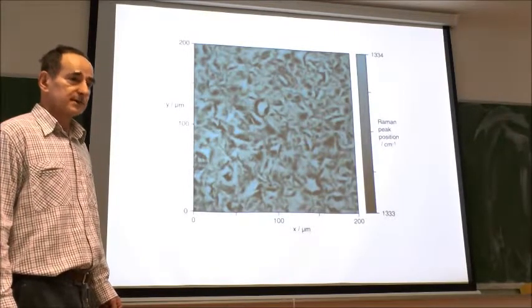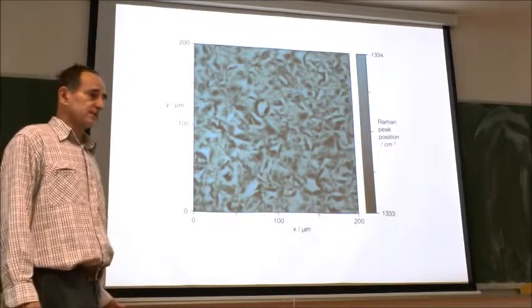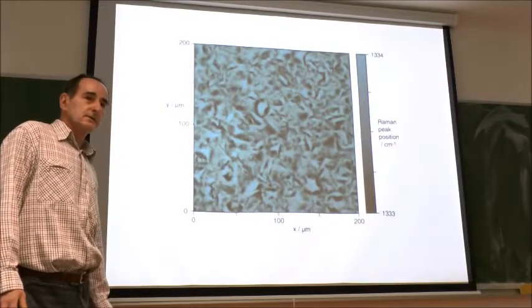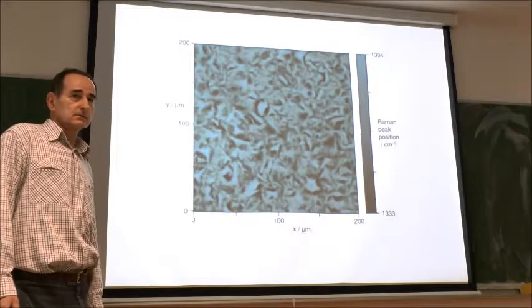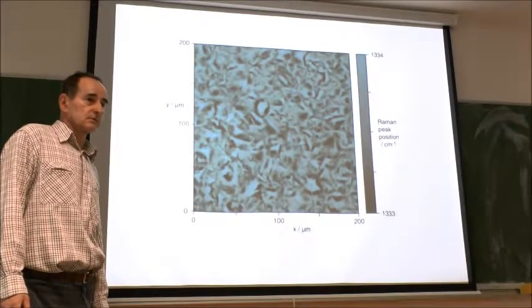On steps, yes. So for somebody who is studying symmetry of crystals or orientation, that would be a pretty good instrument to work on.